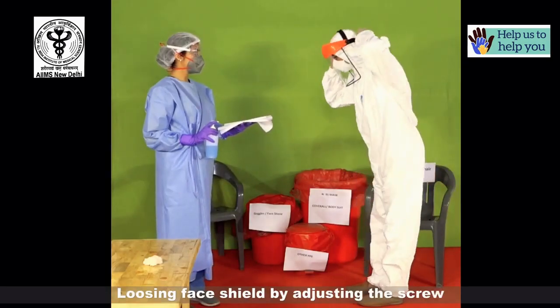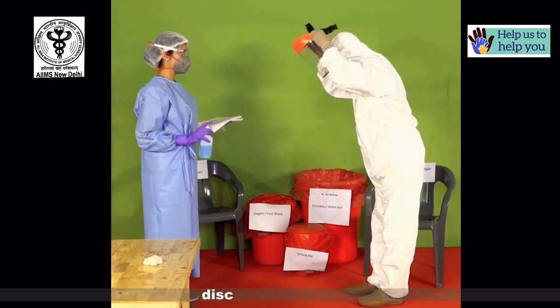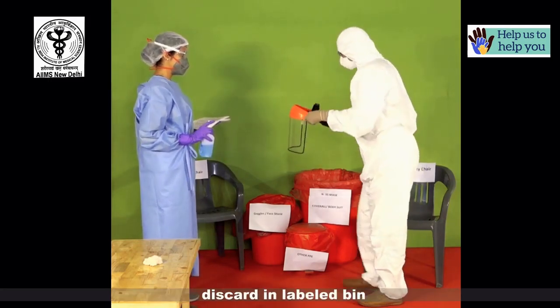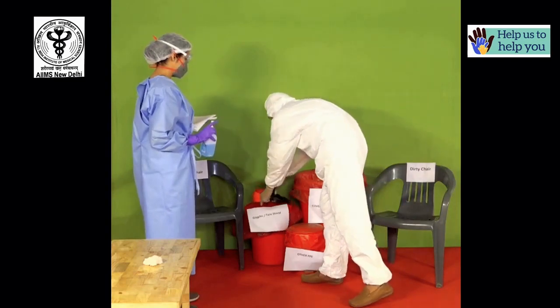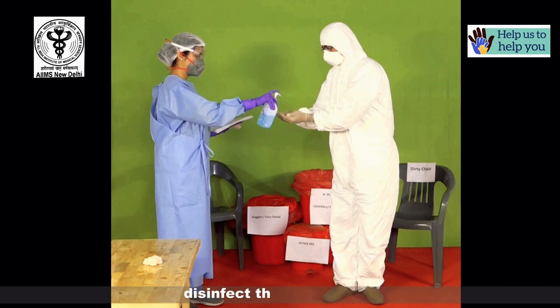Loosen the face shield by adjusting the screw and remove it by holding it from the back handle. Discard in the labelled bin. Now disinfect the inner gloves.